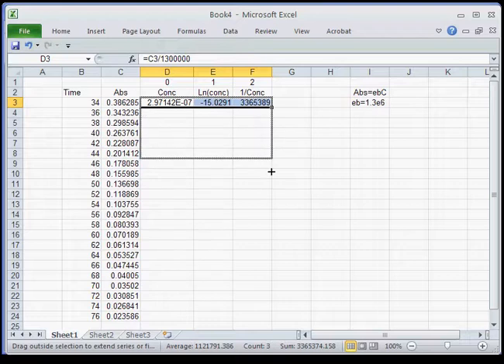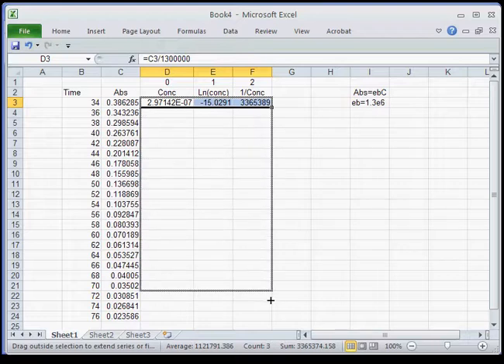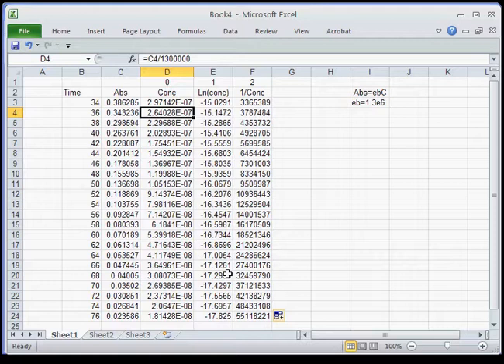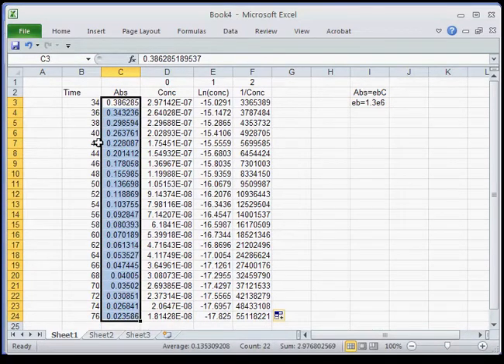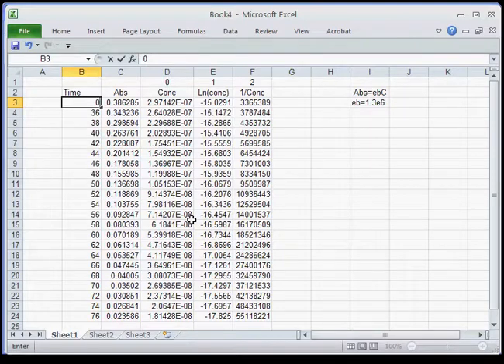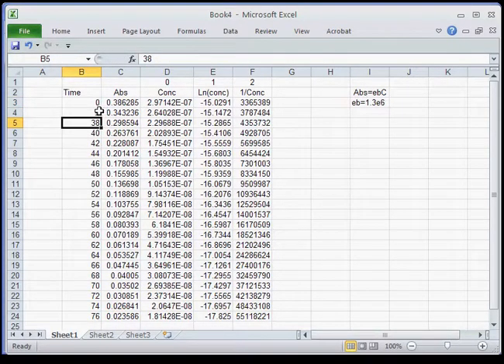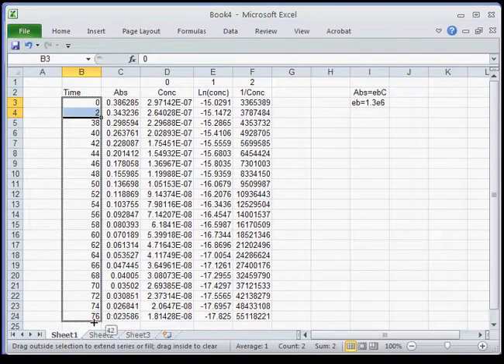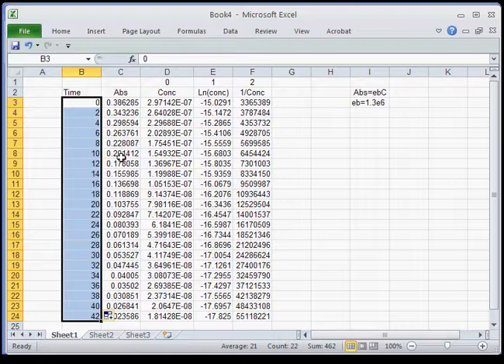Rather than typing all those formulas over and over again, I highlight the three formula cells, grab the little black dot at the corner, and drag it down. The formula is now pasted and all cells reference the correct columns. I also need to fix the time column — my start is at 34, but I want it to start at 0. I enter 0, highlight it, grab the corner, drag it down, and it automatically fills in with 2-second intervals.